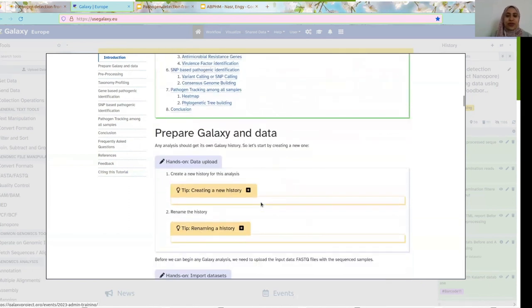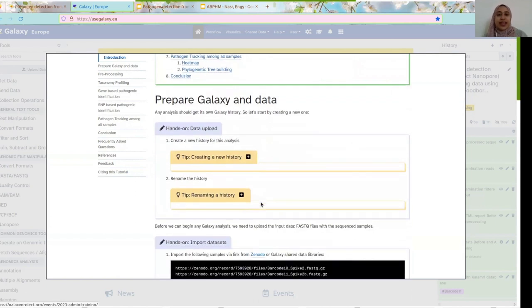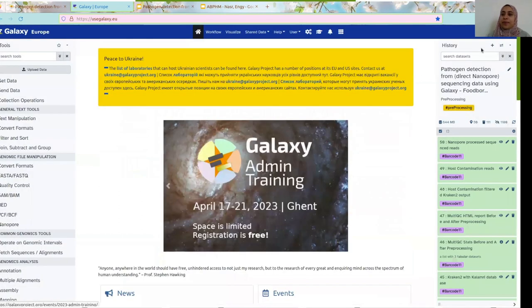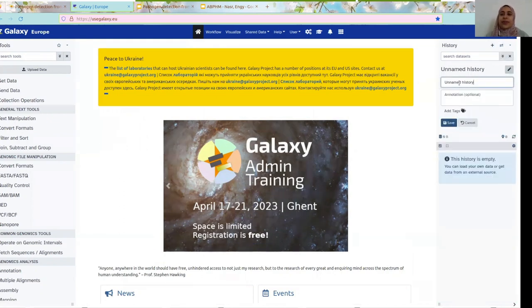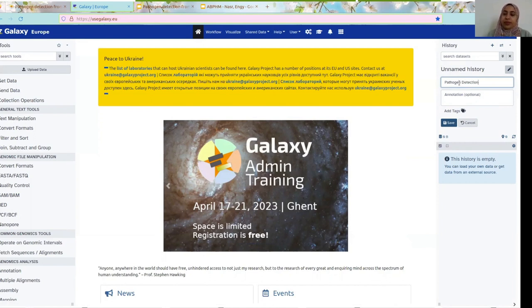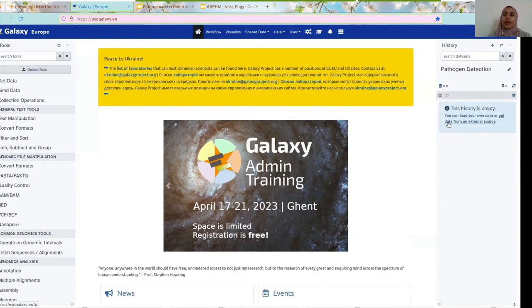Let's start by preparing our Galaxy history and importing the test datasets. So as a first step, you click on the plus sign here to create a new history. You name it whatever you want — for example, 'pathogen detection' — and you click save. The next step is to import your datasets. You will see here two links for the datasets. All you have to do is press copy.